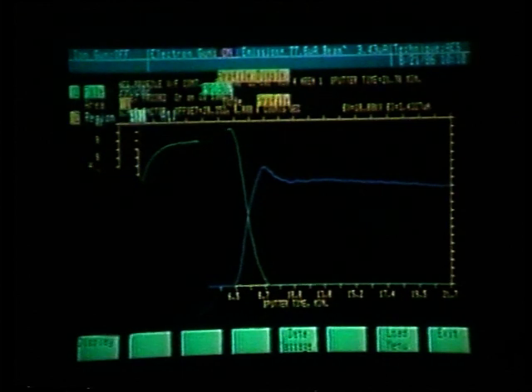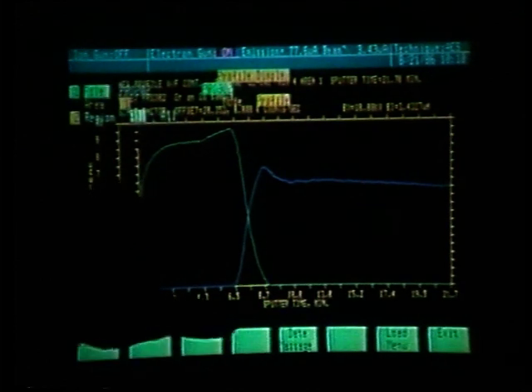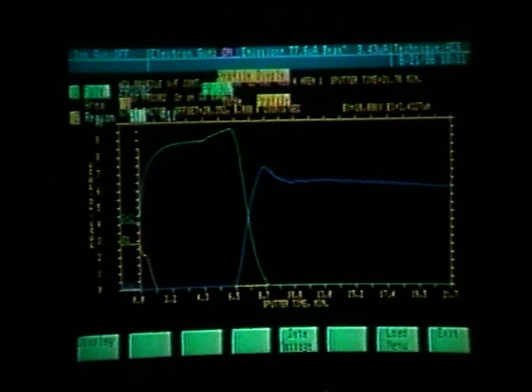Those are difficult to interpret at this point because we cannot look at the windows and find out whether the peaks actually moved. We can only believe that the peak minus background somehow changed a little bit here and a little bit here on both the chromium and the copper.